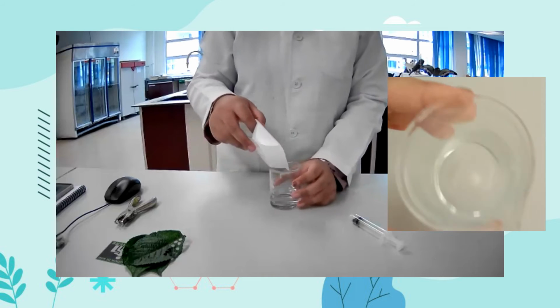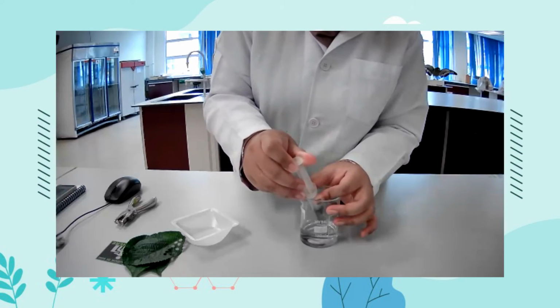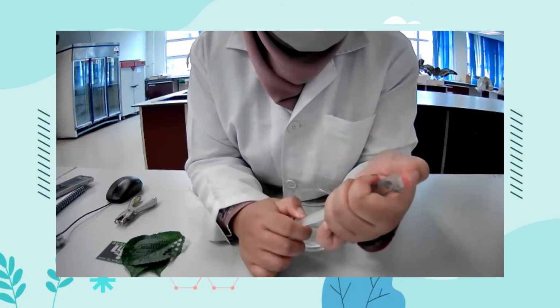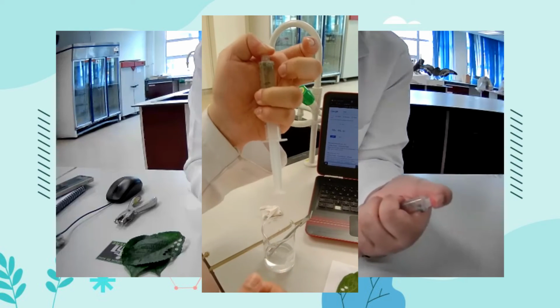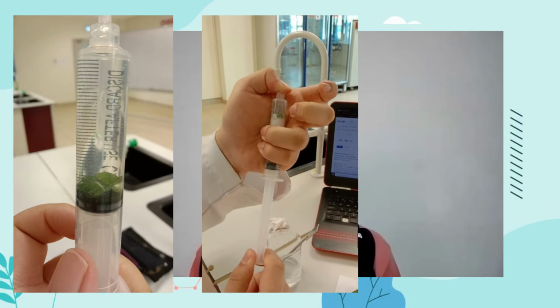Moving on, mix 0.5 grams sodium bicarbonate with 50 ml of water and draw about 6 to 8 ml of bicarbonate solution into the syringe. Leaf discs should float in the solution. Next, we're going to expel the air by holding the syringe with the tip up and gently pushing on the plunger. Next, plug the tip with your finger and gently pull the plunger to create a slight vacuum. There should be tiny bubbles produced and some of the discs should sink. We're going to repeat this until all the leaves sink.